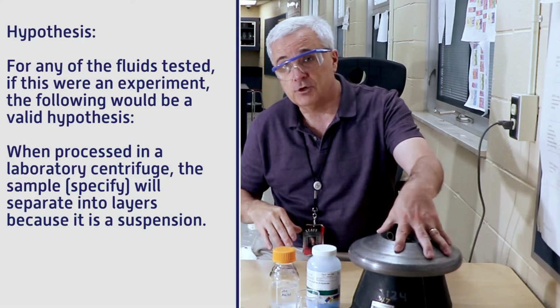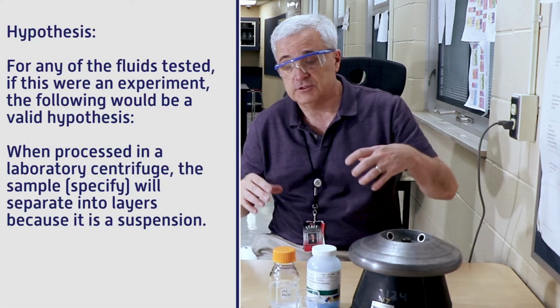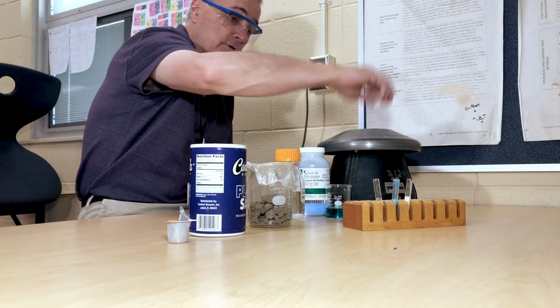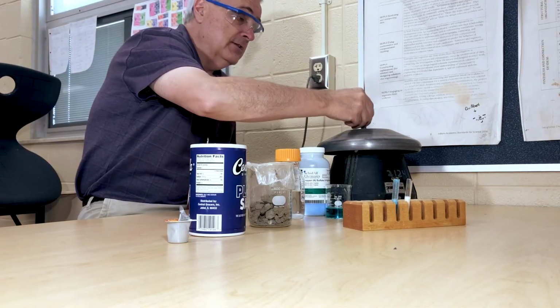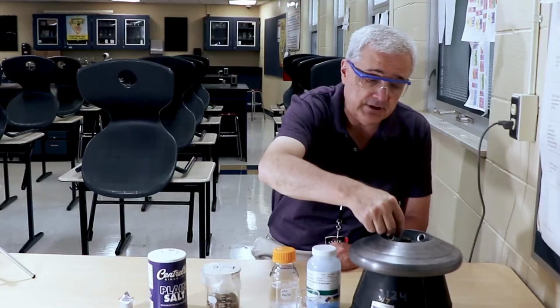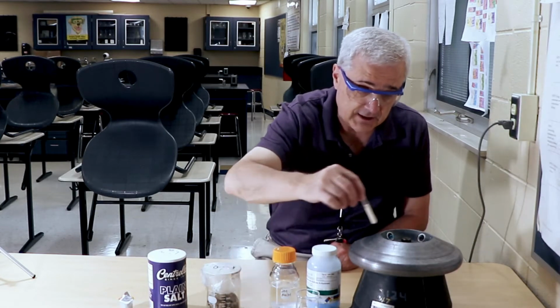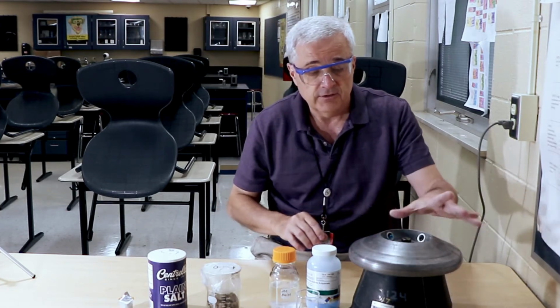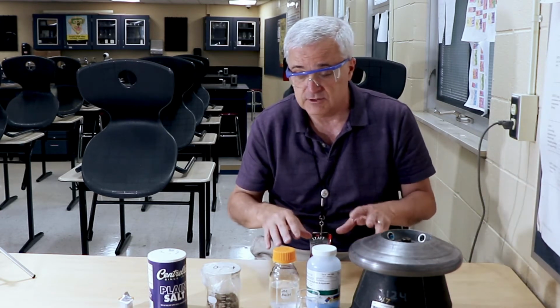So the more dense particles, the centrifugal force will cause those dense particles to settle, just like if you let it sit out in gravity. So we're going to go ahead and load the centrifuge. And very simple. The key thing is that your samples need to be approximately the same weight. It depends on your centrifuge, of course, but for this one, if they're approximately the same weight, it'll stay in balance, it'll spin.